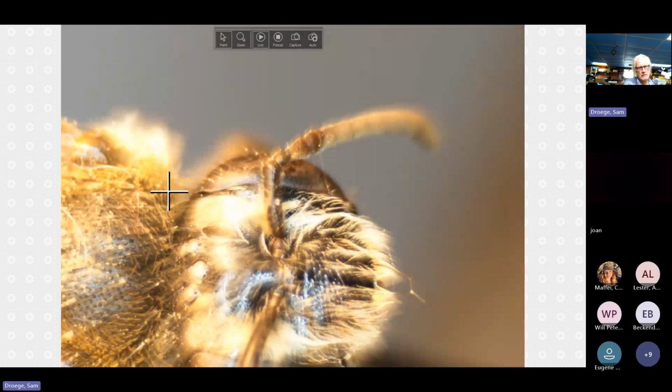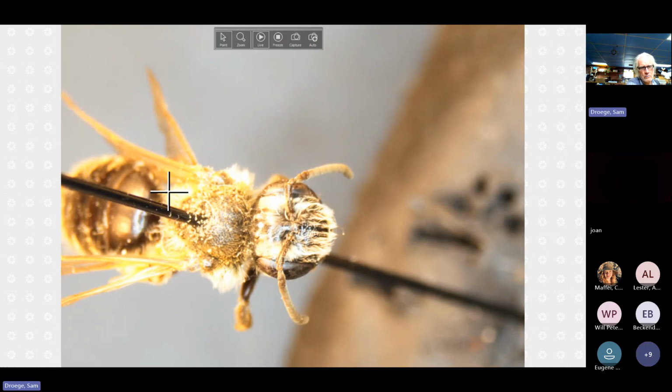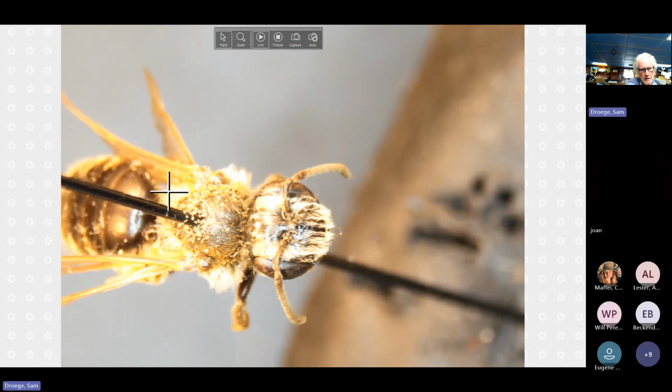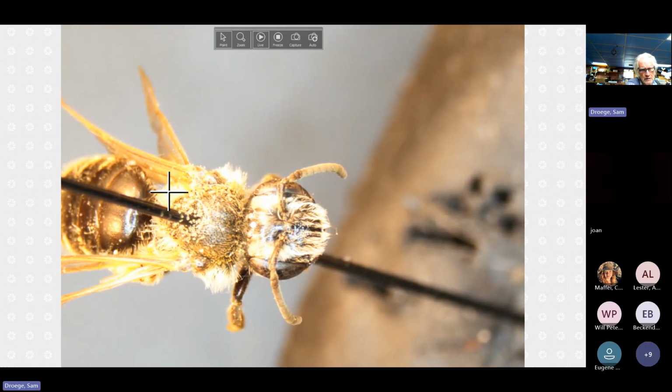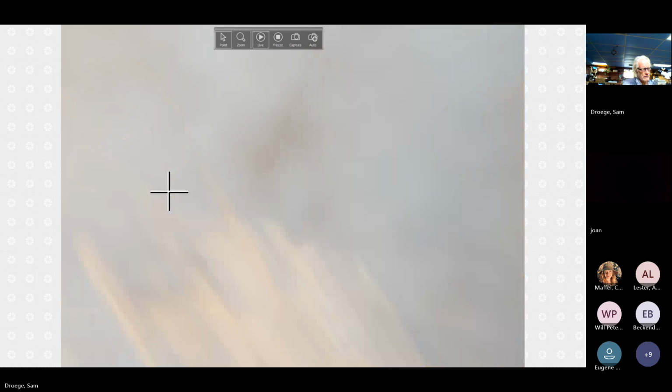And T1, we don't need to look at that again. Maybe it'll zoom out, but I'm going to focus on T1 from here. But you get the point. We saw it the last one. T1, heavily pitted. Feel free to interrupt about individual species if you have questions. Otherwise, we're just going to go through each.